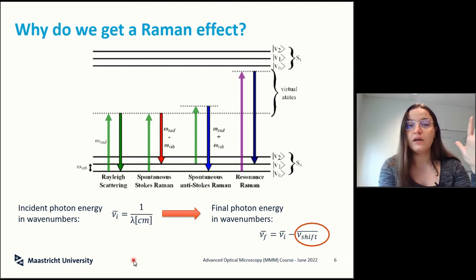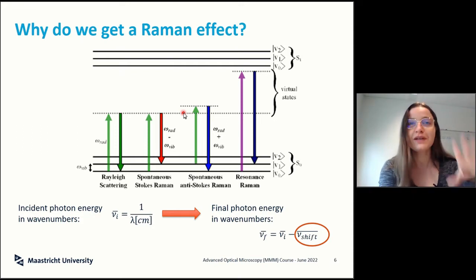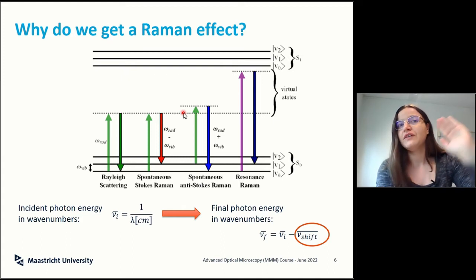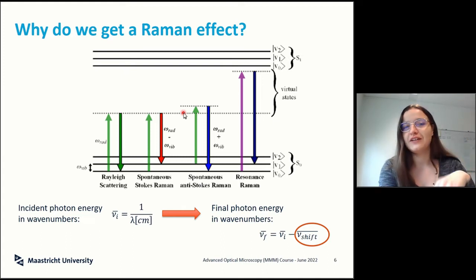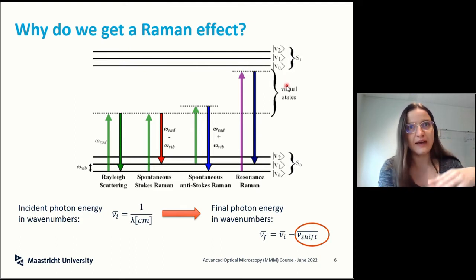Now when we do Rayleigh scattering, we are not absorbing the light, because there will be energy levels way above. This is quantum mechanics stuff, please do not block the video. There are energy levels above, and if you manage to transition to the energy levels above, so these ones that you see here labeled as S1, you actually have basically a photon transition, so you excite the whole molecule to a higher energy state.